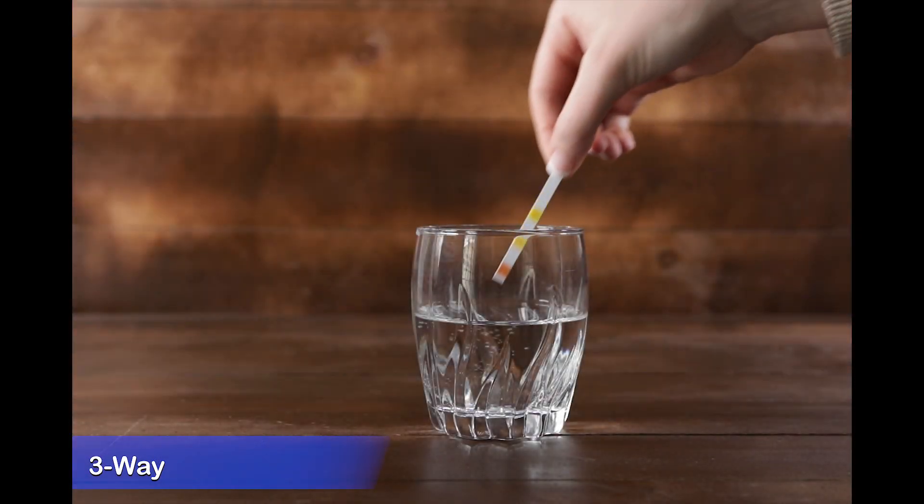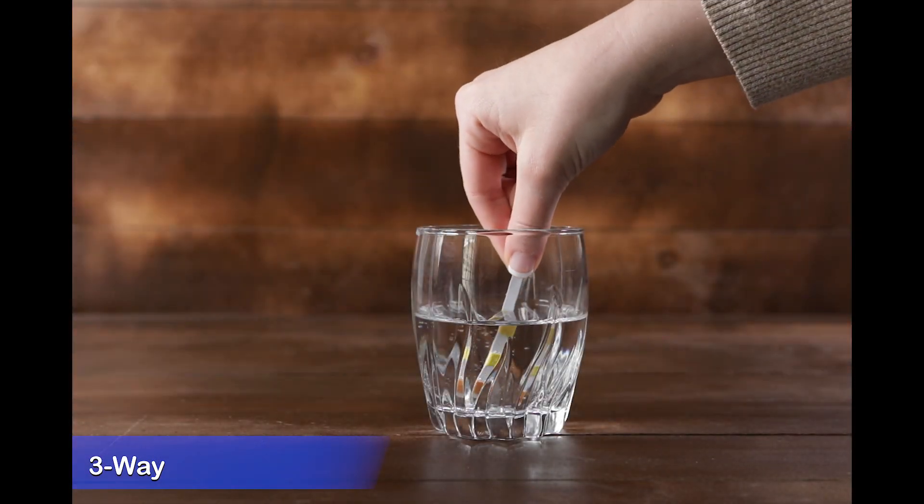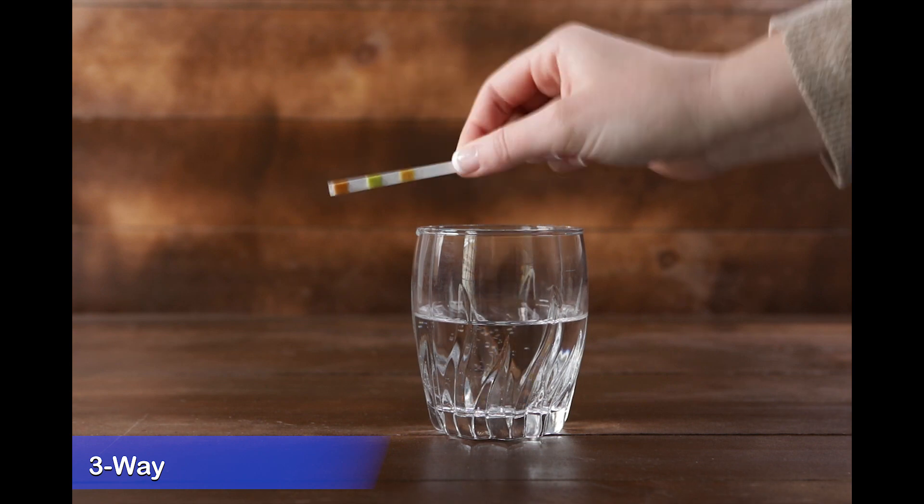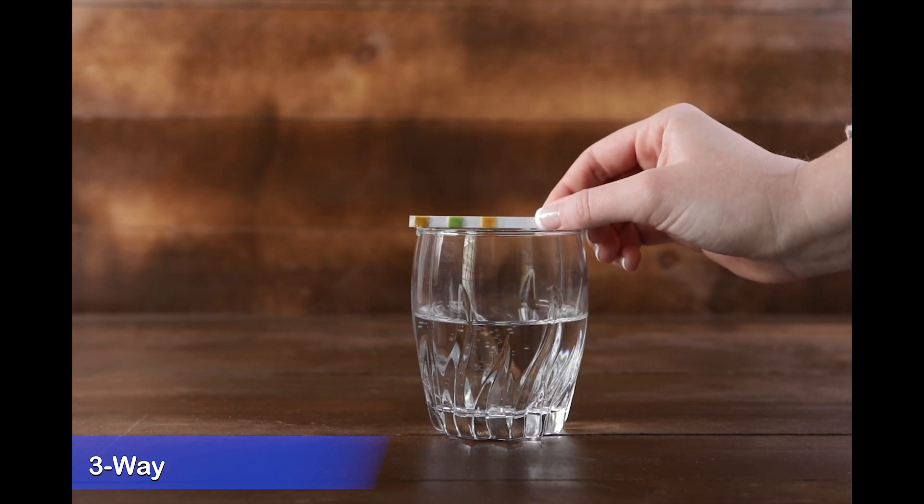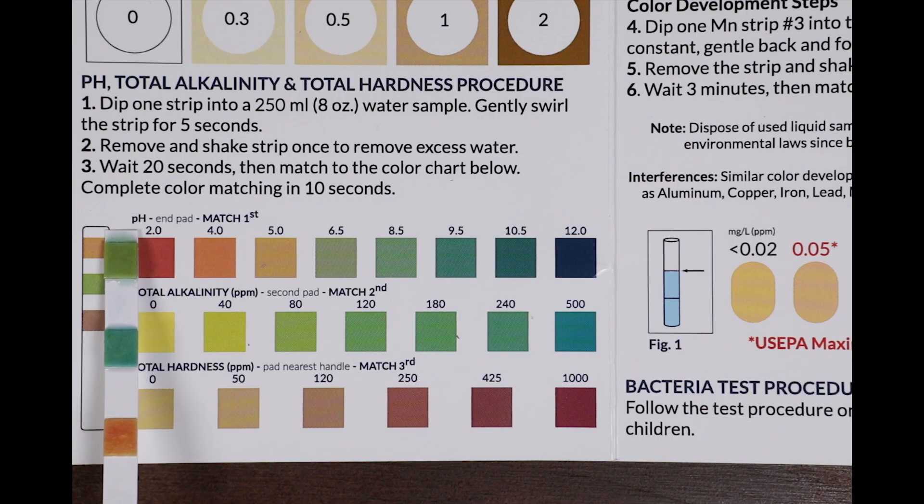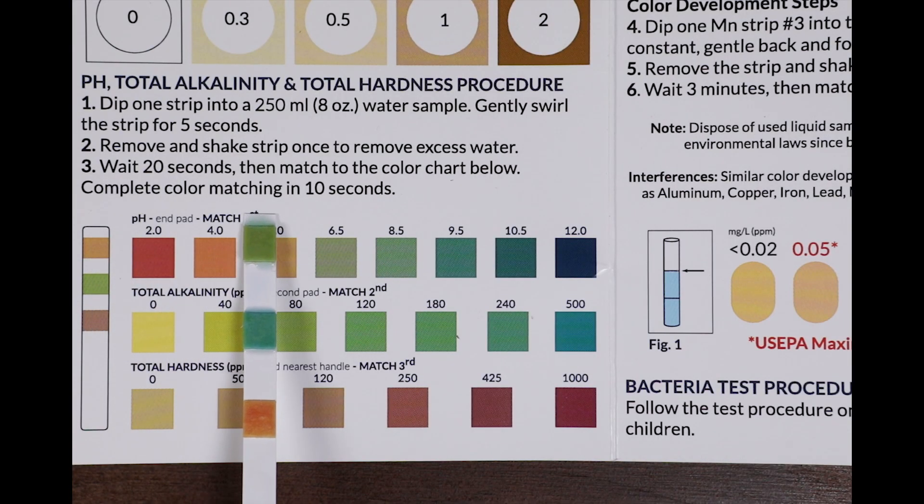Dip the three-way strip into eight ounces of water for five seconds. Remove, shake, and wait 20 seconds for the color to develop. Immediately match the strip to the color chart. The closest match indicates the level.